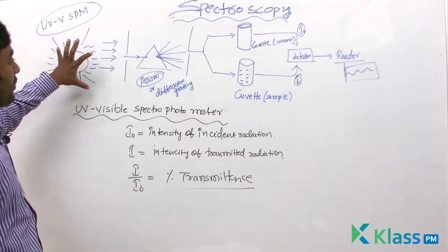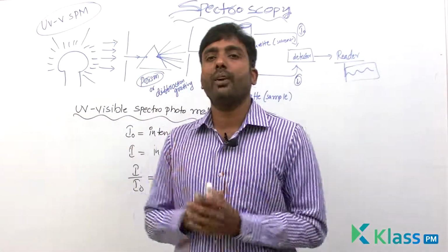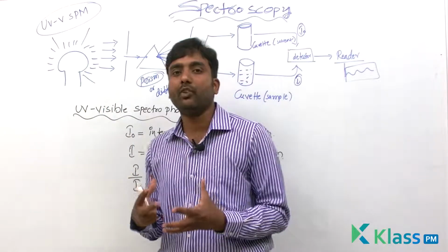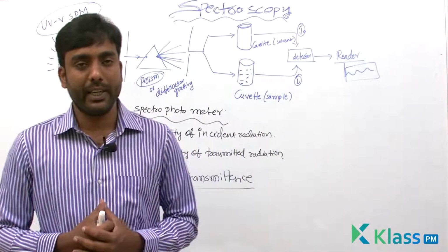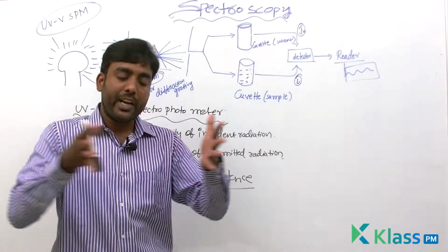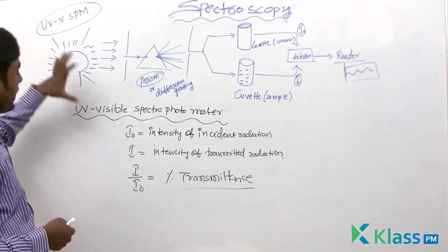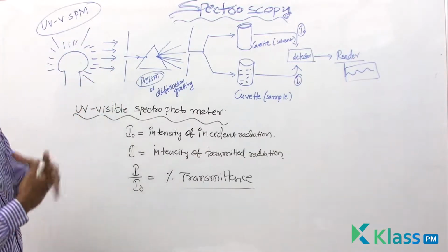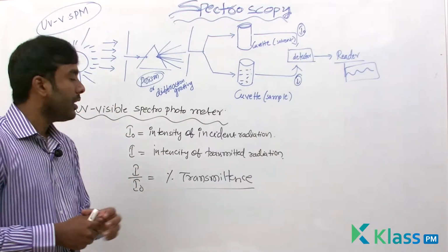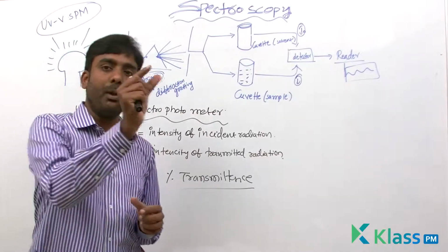There will be a source of radiation, and this source will emit either one particular wavelength or a range of wavelengths, based on what is needed here. Based on our need we select a source which emits a range of radiations or a particular wavelength. The range of wavelengths go out like scattered waves, and by using a slit it is sent as one single beam of light.